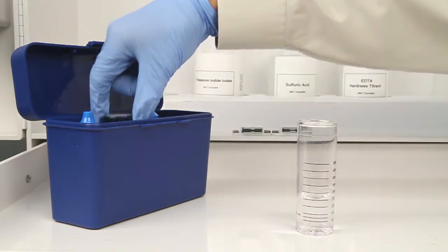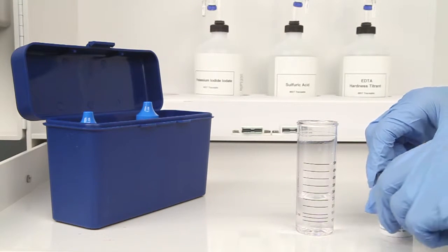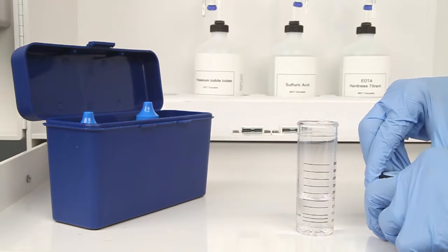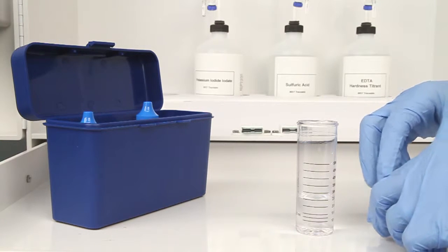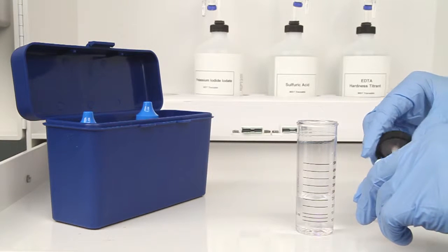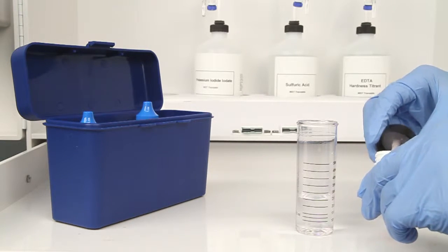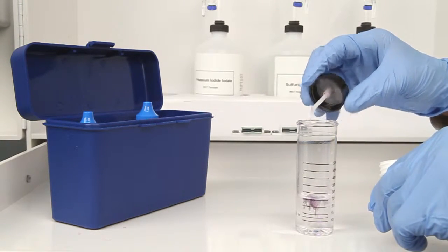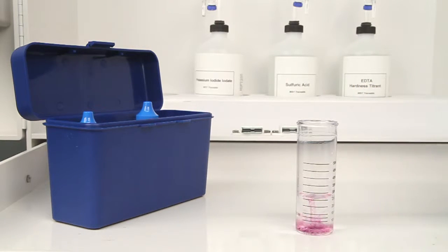The next step is to add one scoop of hardness indicator powder. After the addition of the powder, swirl the vial to ensure the powder is completely dissolved. In this case, the sample turns red, indicating that hardness is present.